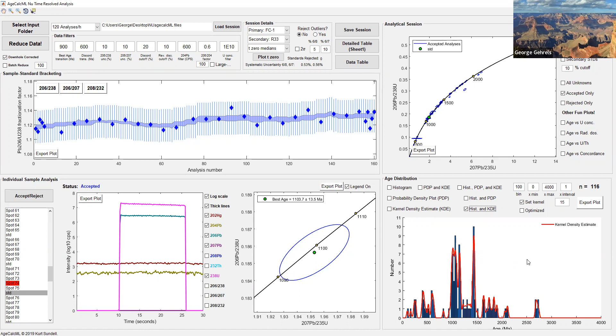This is just a quick run through of our age calc software. I think the next thing we'll do is start the live tour through the lab. This will be your chance to offer some questions and observations about the lab. Let's fire up the live tour and do the demo.